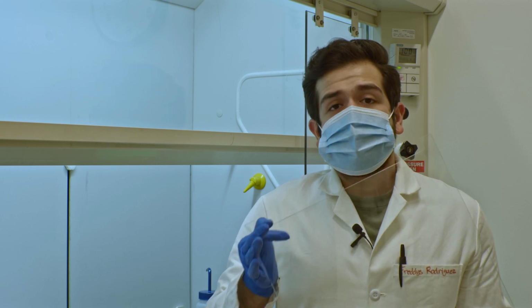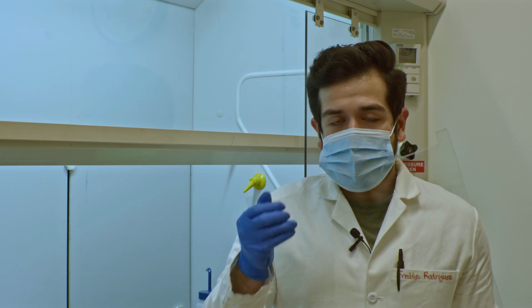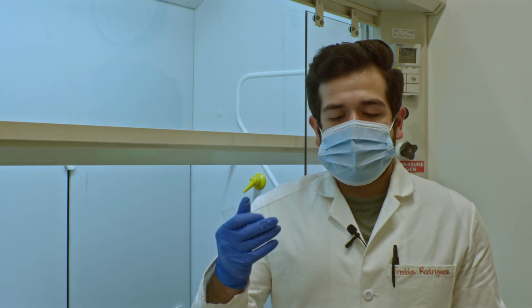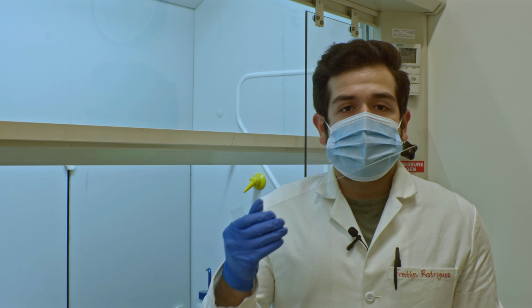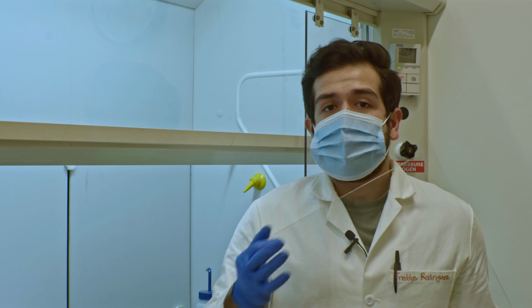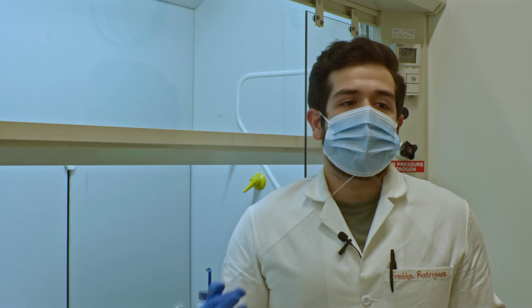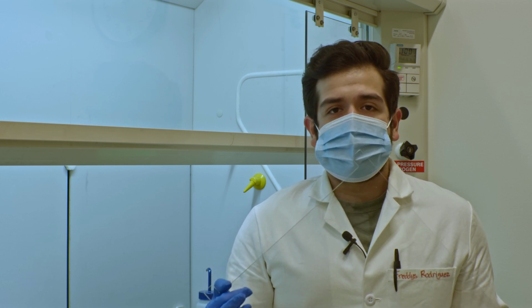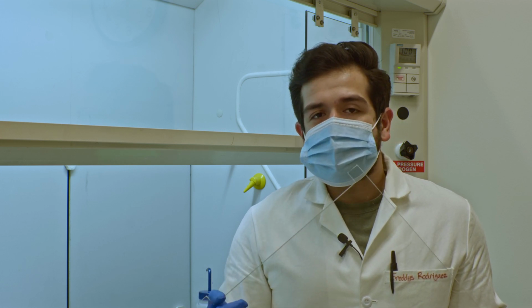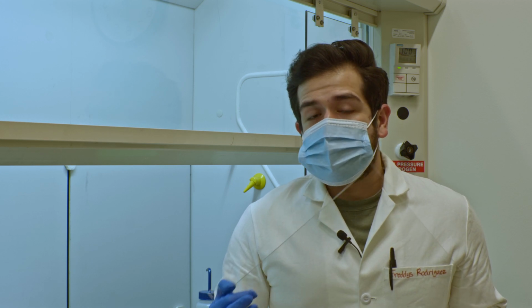So make sure that you've effectively cleaned these glass plates as well as the plastic spacers that go into these glass plates before you ever make your gel. What I do is spray these with water, making sure that I can scratch off all the hard little pieces of gel that might have been there from a previous run, and then I go with ethanol, and it works twofold. It makes the gel pieces that were there before a little easier to scratch off if you couldn't get them with water, because it dries them up, and it also dries up the water much quicker.